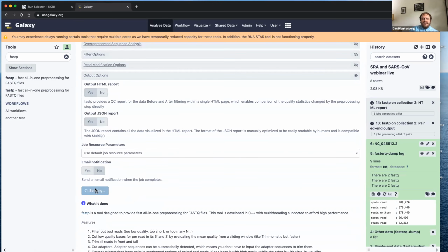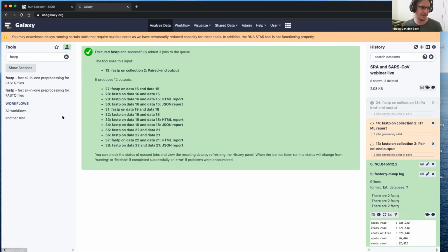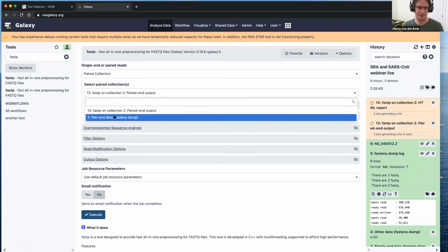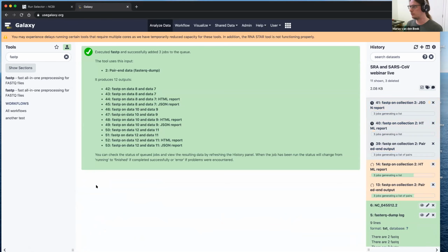You need to select the correct input data set as well. You selected the fastp output. Yeah. Not a problem. Galaxy is very patient. It's very good for dummies like me. And the real pro trick here is that once you know what you are doing, you can generate a workflow to not need to think about this and just do what you want to do.